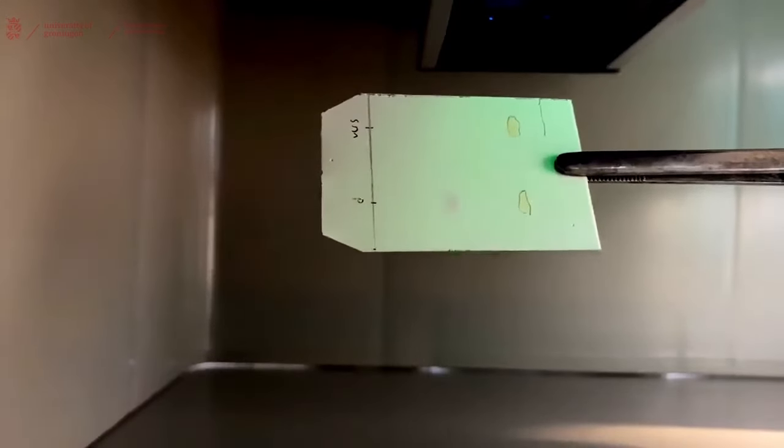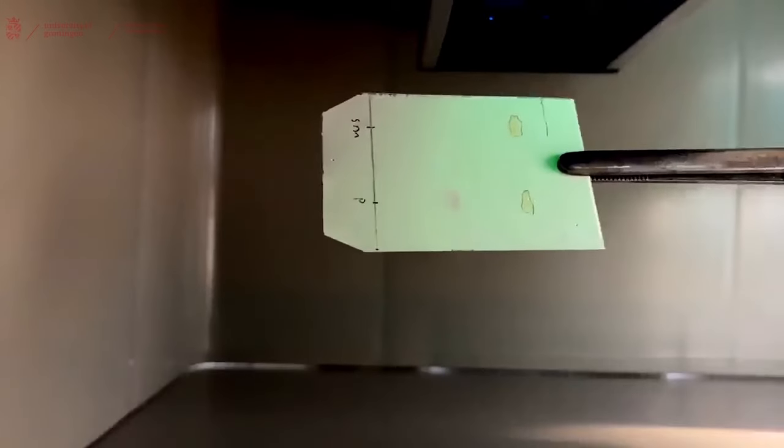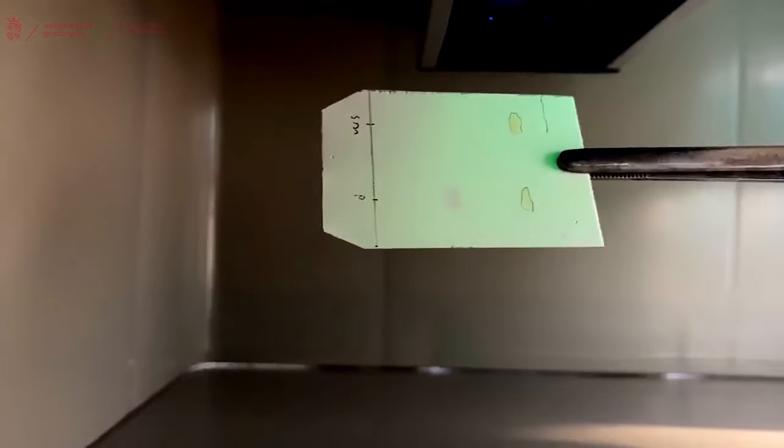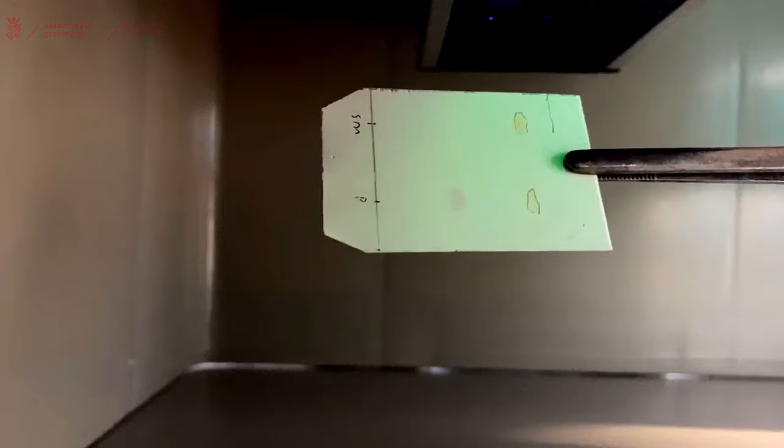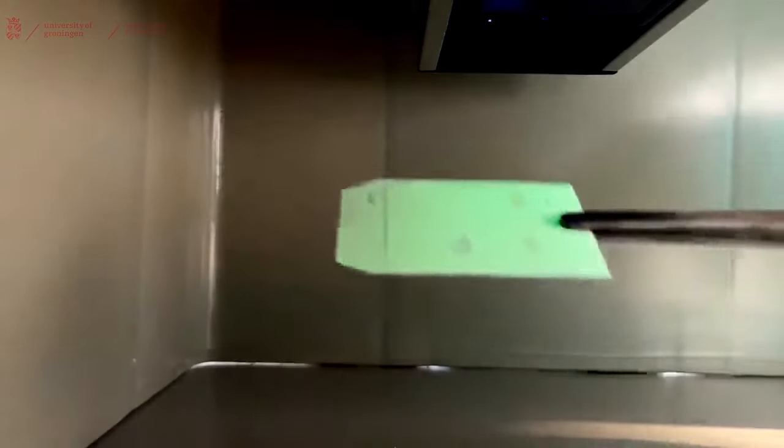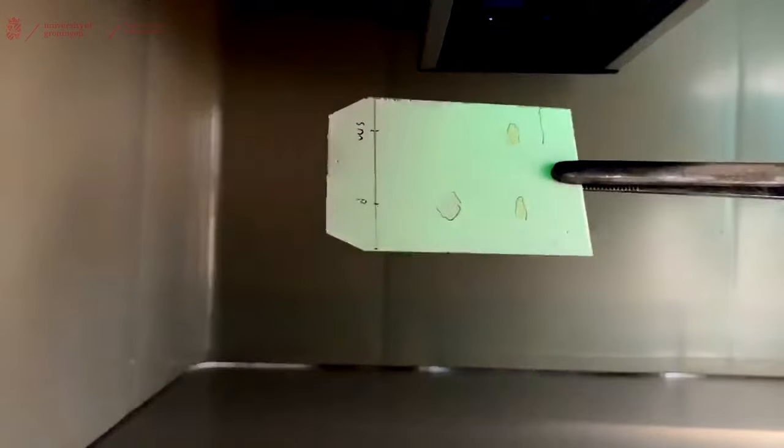If we remove the TLC plate from underneath the UV light we won't be able to see the spot anymore. So we have to make sure that we circle this spot with pencil before removing it from the UV light.